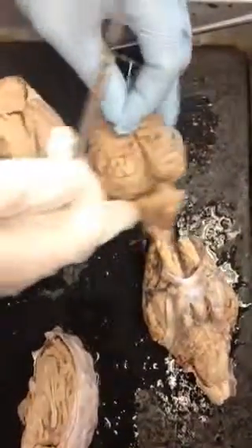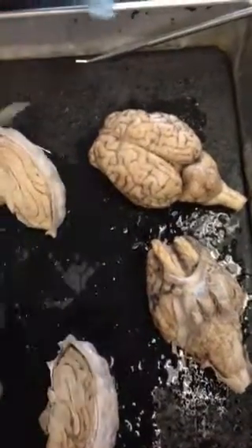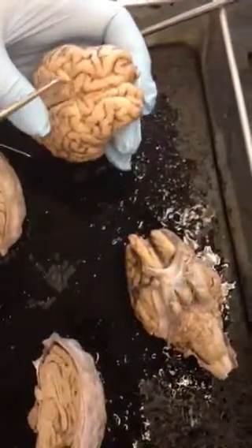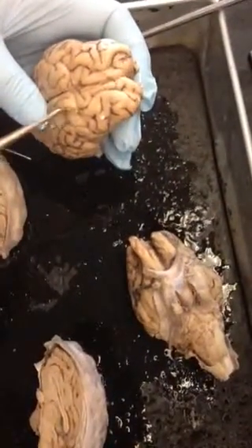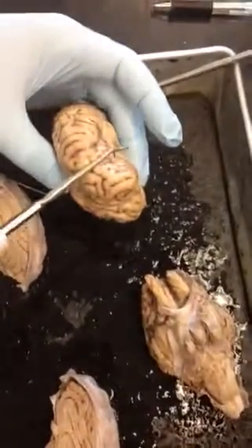That's the central sulcus. So it's basically right there. Right? It's just a line. Yeah, sort of. It's this right here. Those lines, and then it kind of goes right there, like that, all the way down the side.